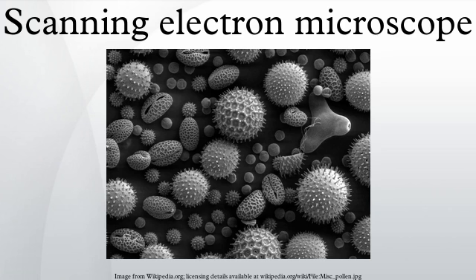Sample preparation. All samples must also be of an appropriate size to fit in the specimen chamber and are generally mounted rigidly on a specimen holder called a specimen stub. Several models of SEM can examine any part of a 6-inch semiconductor wafer, and some can tilt an object of that size to 45 degrees. For conventional imaging in the SEM, specimens must be electrically conductive, at least at the surface, and electrically grounded to prevent the accumulation of electrostatic charge at the surface. Metal objects require little special preparation for SEM except for cleaning and mounting on a specimen stub.